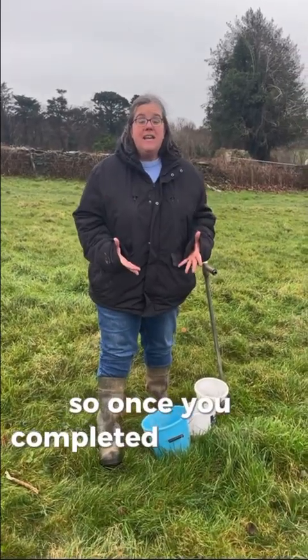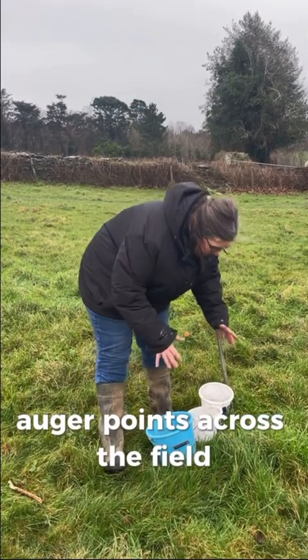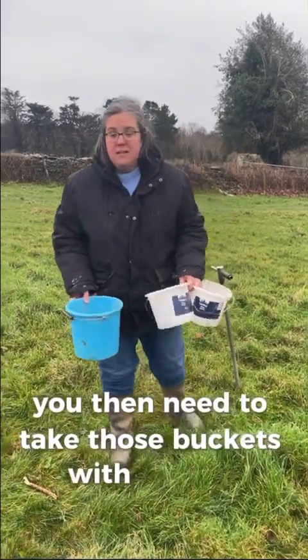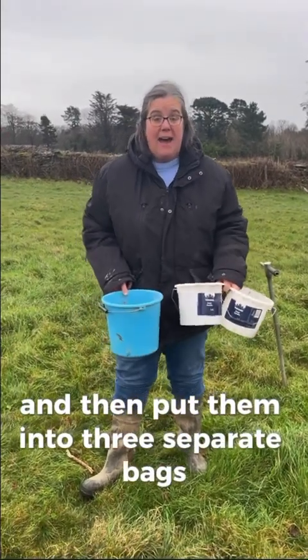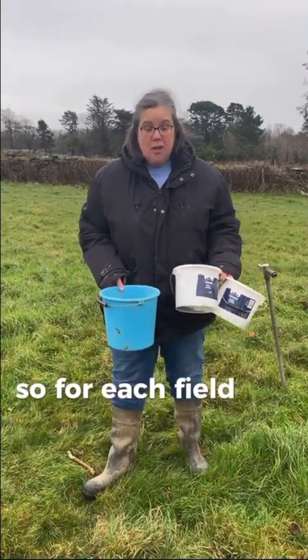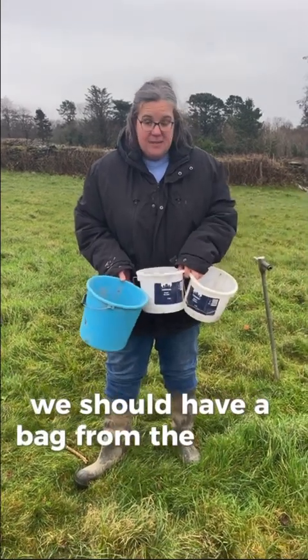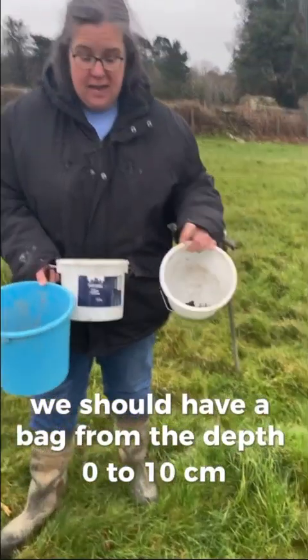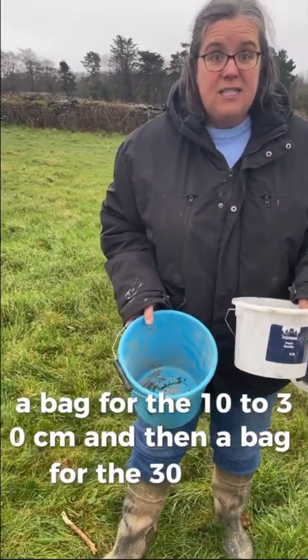So once you've completed all of the 15 to 20 auger points across the field, you then need to take those buckets with the soil and then put them into 3 separate bags. So for each field, we should have 3 bags for carbon sampling. We should have a bag from the depth 0 to 10 centimetres, a bag for the 10 to 30 centimetres, and then a bag for the 30 to 50 centimetres.